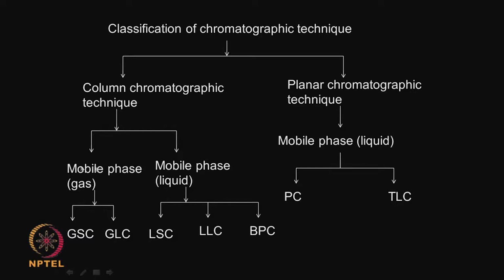So, the mobile phase there is a gas. Okay. So, the solid phase or the stationary phase could be a solid, completely solid, or a liquid which is immobilized on a solid phase. Okay. So, this is a gas chromatograph.